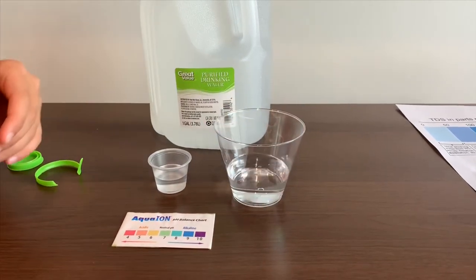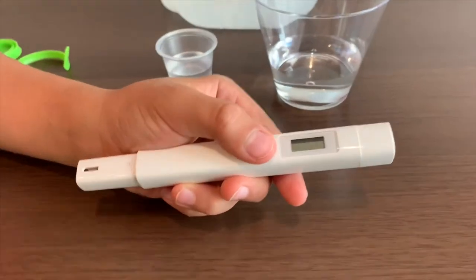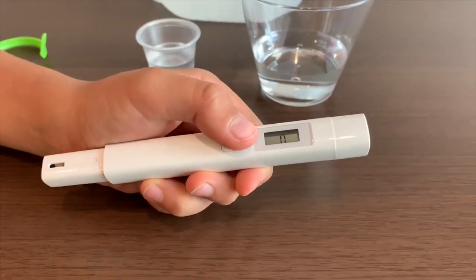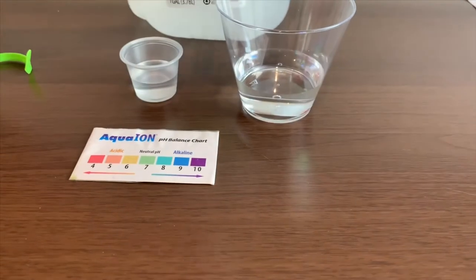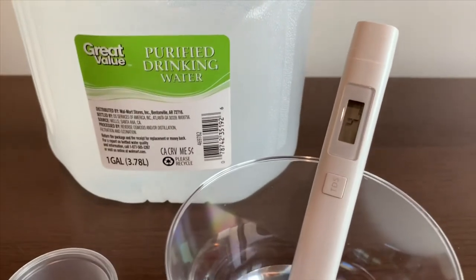First, let's test the TDS level. If you want to buy this TDS tester, check the link down below. Turn on the TDS tester, make sure it says zero, and put it in. Four — that is ideal drinking water.